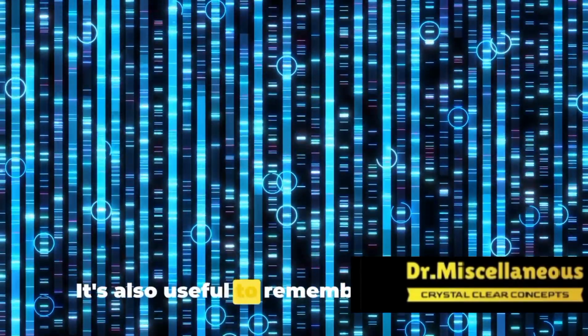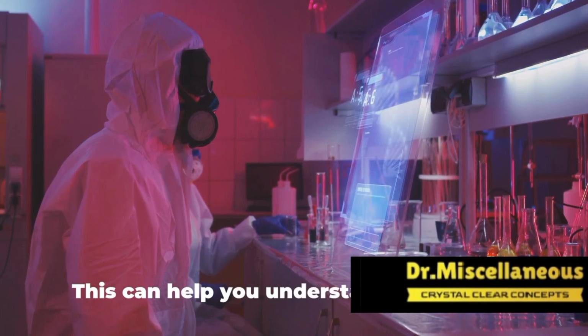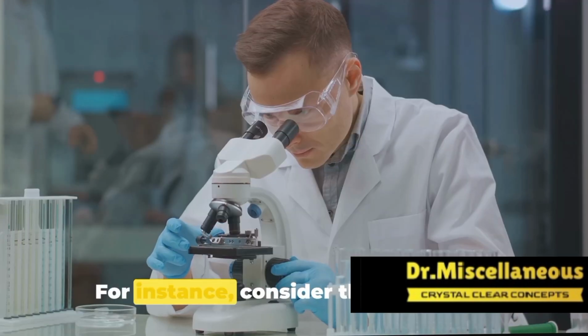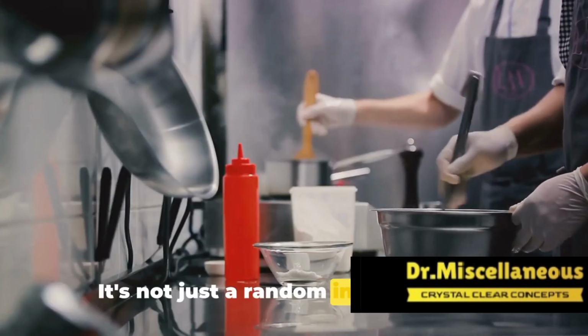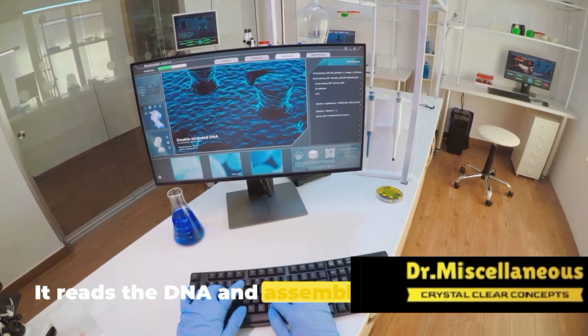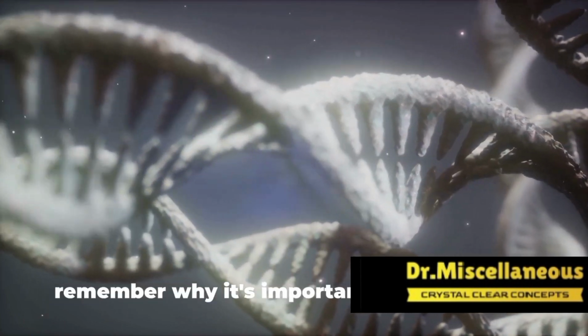It's also useful to remember the purpose of each step in the process. This can help you understand why things are done in a certain order and why certain materials are used. For instance, consider the role of the DNA polymerase enzyme. It's not just a random ingredient, it's the chef that follows the recipe. It reads the DNA and assembles the new strand. Understanding its role can help you remember why it's important in the process.